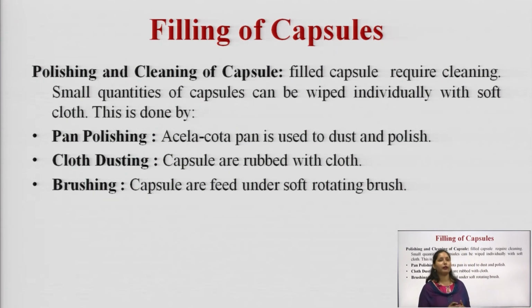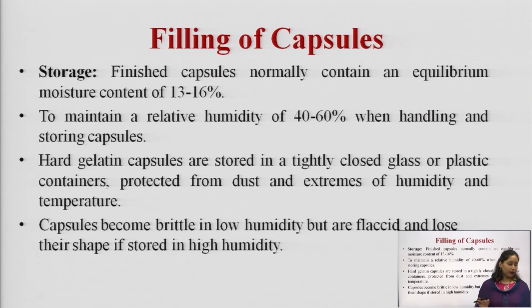So, capsules are fed under soft rotating brushes which remove the dust particles, and also polish the surface of the capsule. So, this is all about the filling of the capsule by manual hand operated capsule filling machine. Then, filling of capsule. Okay.